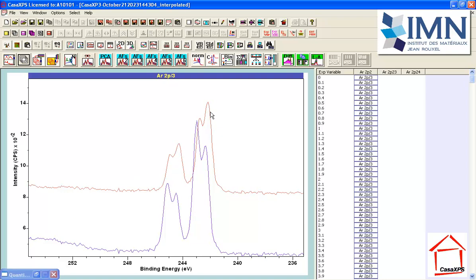And this other doublet pair, well, the surface plasmon is not in the same position. In fact, it looks relatively flat. So while this is not definitive evidence that we have additional peaks, it's suggesting that we need to think about it rather than just assume that we had two sets of doublet peaks that would fit the data, so everything was just fine. Here we have something that I can relate to the physics of what I expect electrons to do when they leave an aluminium metal sample.